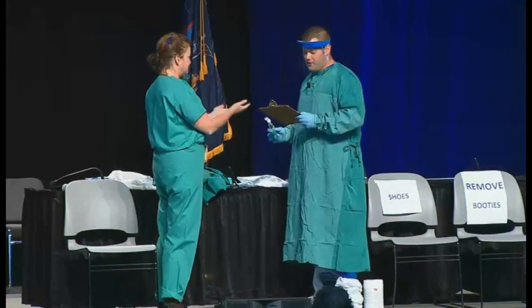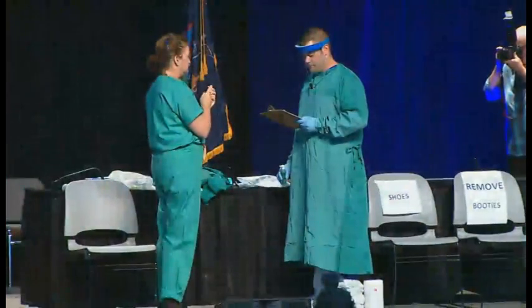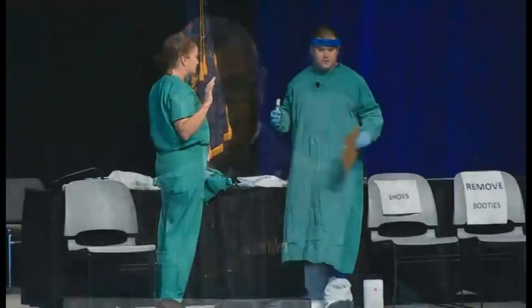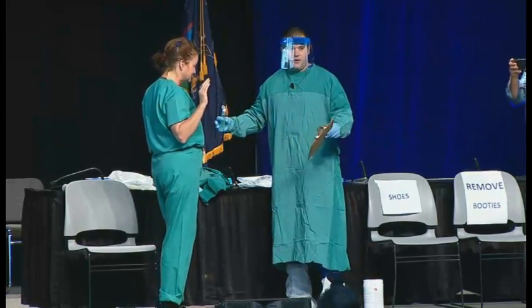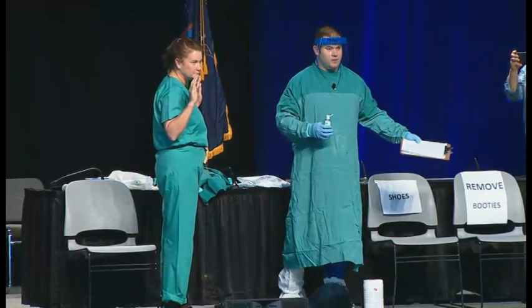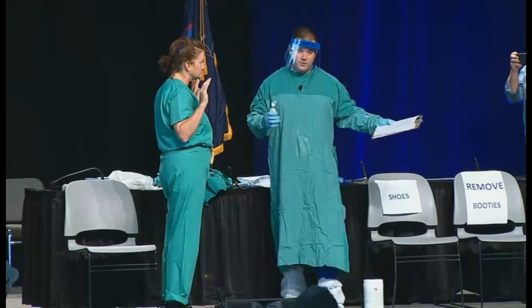Next, Barbara's going to clean her hands with alcohol-based hand sanitizer. We're also going to refer to this as hand hygiene. One of the reasons we recommend scrubs under the equipment is that they make it easier to put on and take off the equipment, and they ensure that you don't have any personal items brought into the care area. This is our clean area, and then we're going to simulate patient care over there, and this will be a dirty area for doffing or removing PPE.